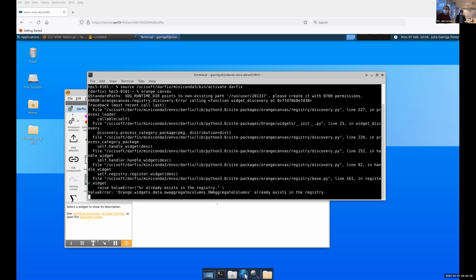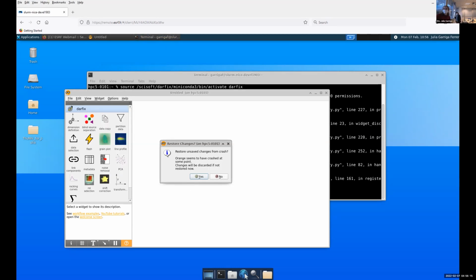So we give you a bit more time to open orange. And then if someone wants to volunteer and show us how to load a data set. Exactly. This way, you can have some feedback and you can also try it yourself, and you can answer any problem or question. You can stop sharing and you can share your screen, and we see how you do it.